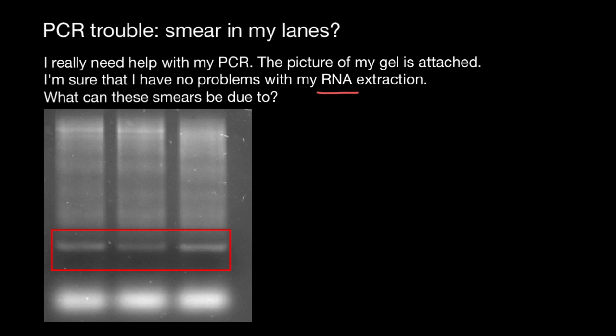My first advice would be to clean your comb before you use it, because the comb can very often be a source of the contamination that we see here.